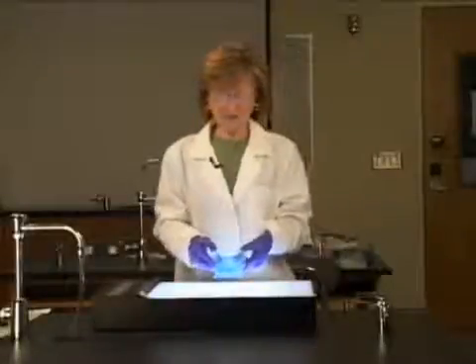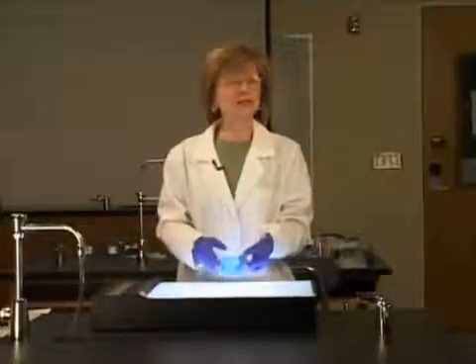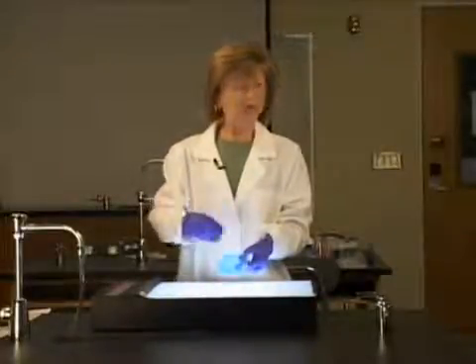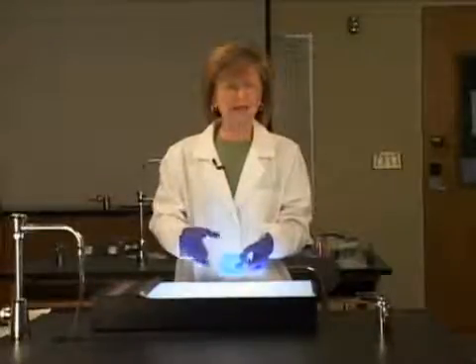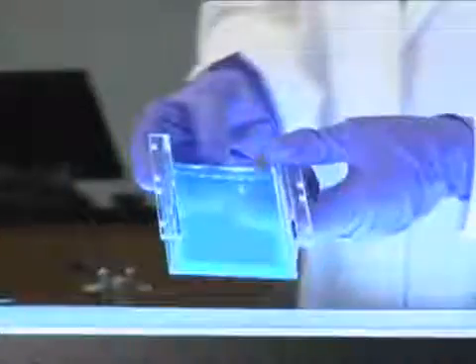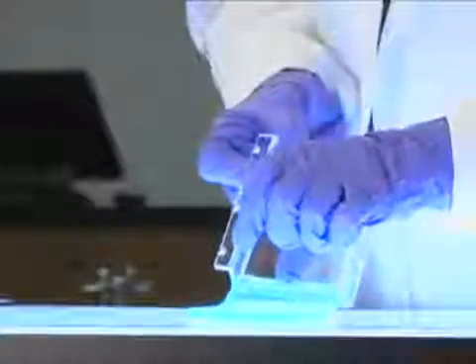So we have run this 0.8% agarose gel at 130 volts for 45 minutes. And we turned it off, and we stained this with a small amount of dye for 20 minutes. And then we destained it, rinsed it in ultra-pure water for another 20 minutes. And you can see now we're going to look on the light box. Slide this right off onto the light box so that we can look at the bands.